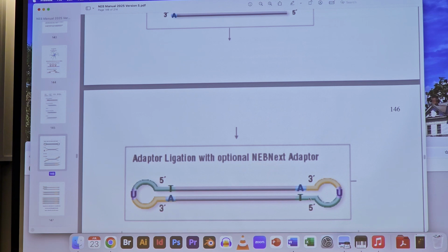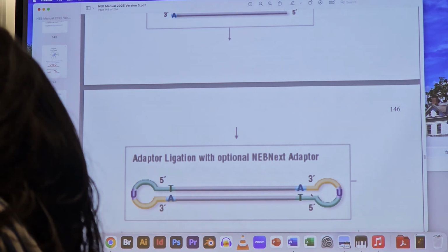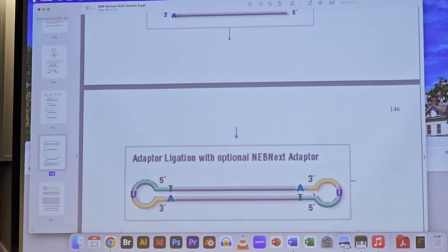The single-stranded adapter's 5' and 3' ends can pair together. This part does not pair because it's not complementary, and so it makes a loop. But this part is paired. I think in the actual adapter, it's about 8 nucleotides to this pair, but I'd have to look it up. And when the U is excised, they don't pair within the adapter? No, when the U is excised, this part will make the straight line, and this part will make the straight line. This part will still be hybridized.